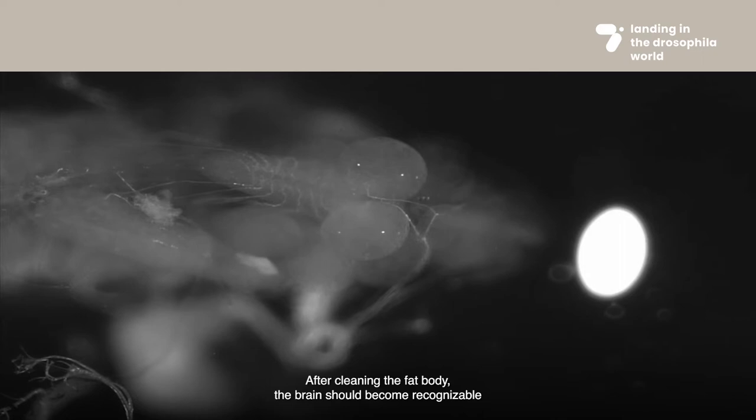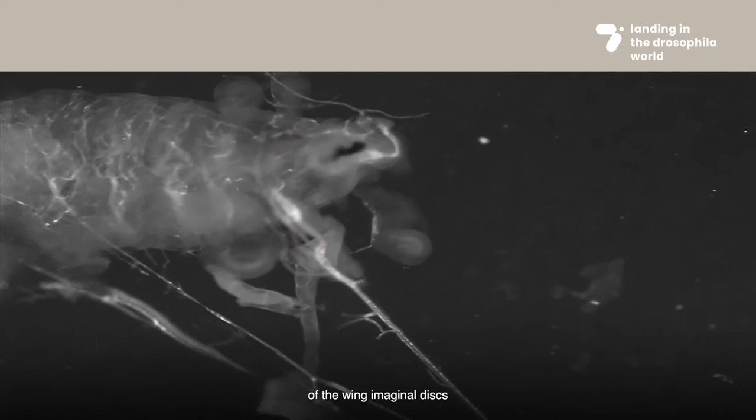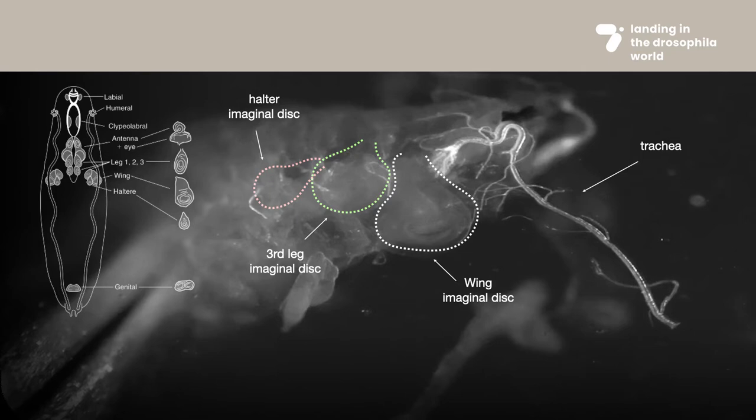After cleaning the fat body, the brain should become recognizable at the anterior part of the inverted larva. You will be able to see the two optic lobes and the ventral cord. At the lateral part of the larva, you will find, usually stuck to the trachea, one of the wing imaginal discs. Close to the wing imaginal disc, you should also be able to identify the halter disc and the third leg disc.